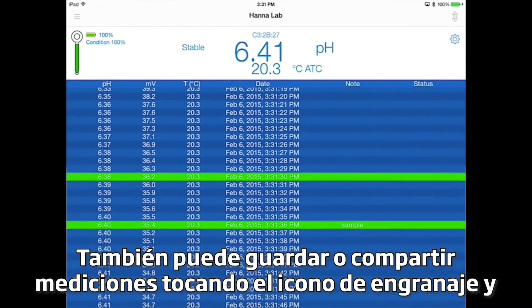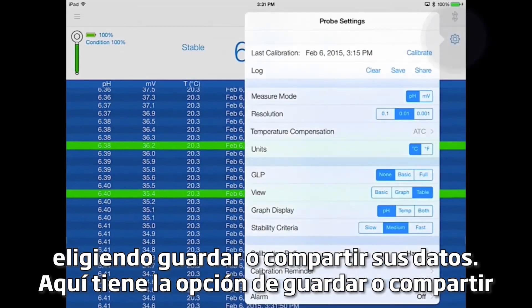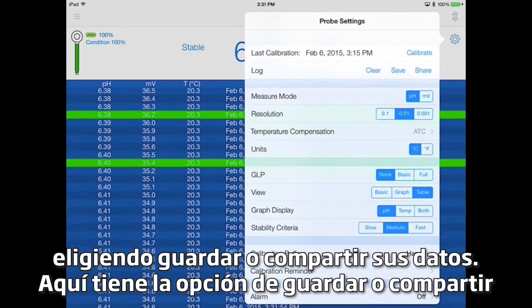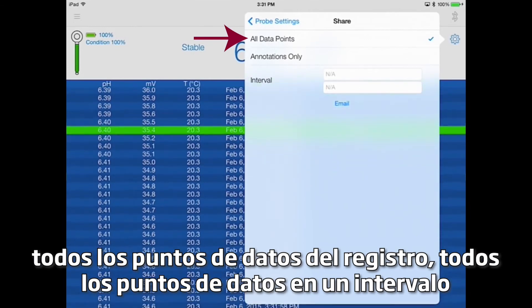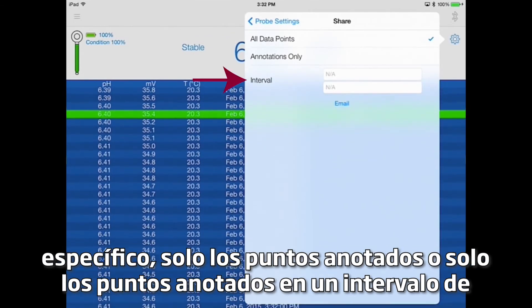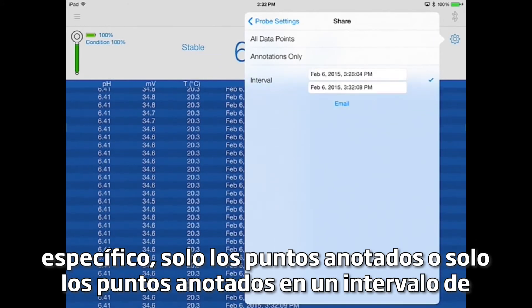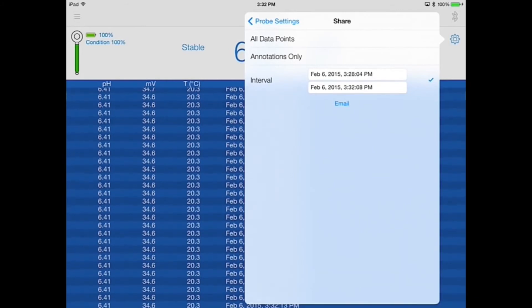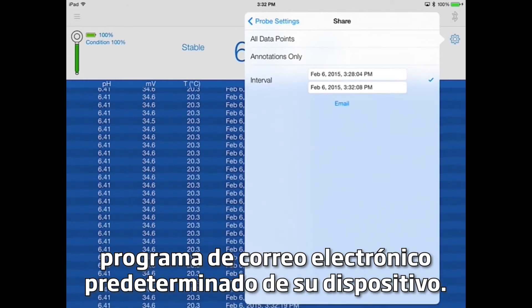You may also save or share measurements by tapping the gear icon and electing to save or share your data. Here, you have the option to save or share all data points from the log, all data points over a specific interval, only annotated points, or only annotated points over a specific time interval. The shared log files are exported as CSV files and are sent by your iPad's default email program.